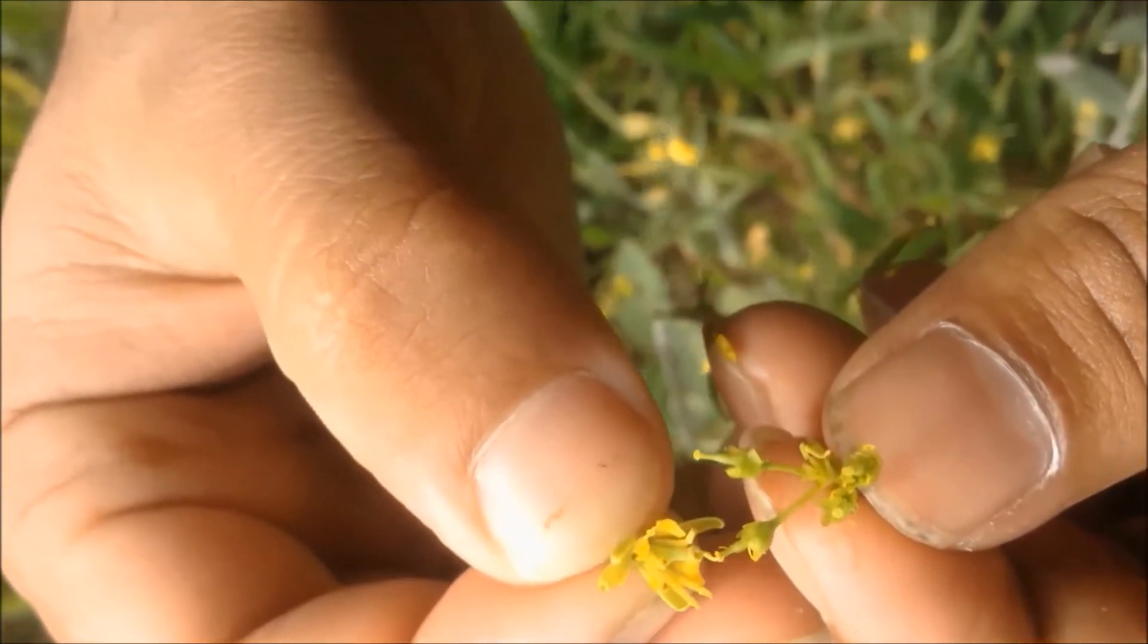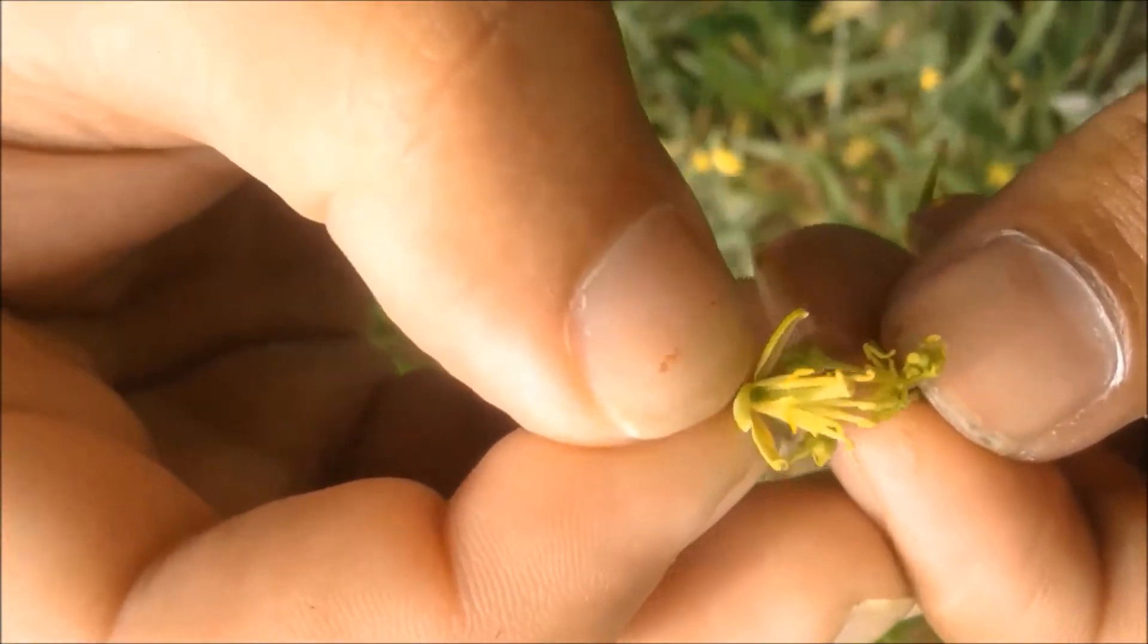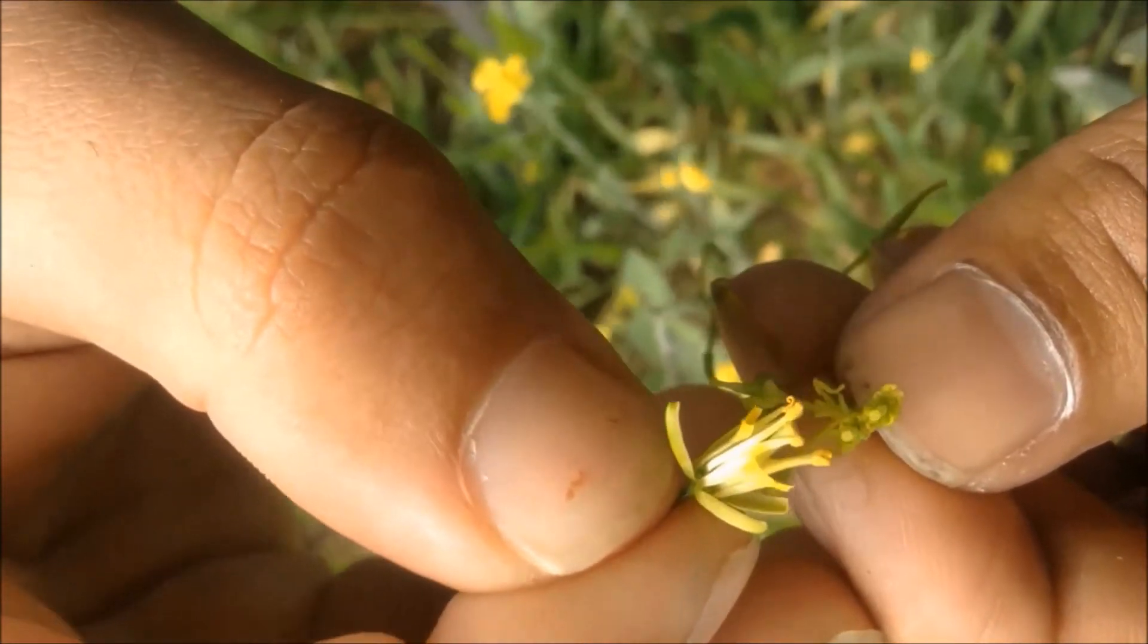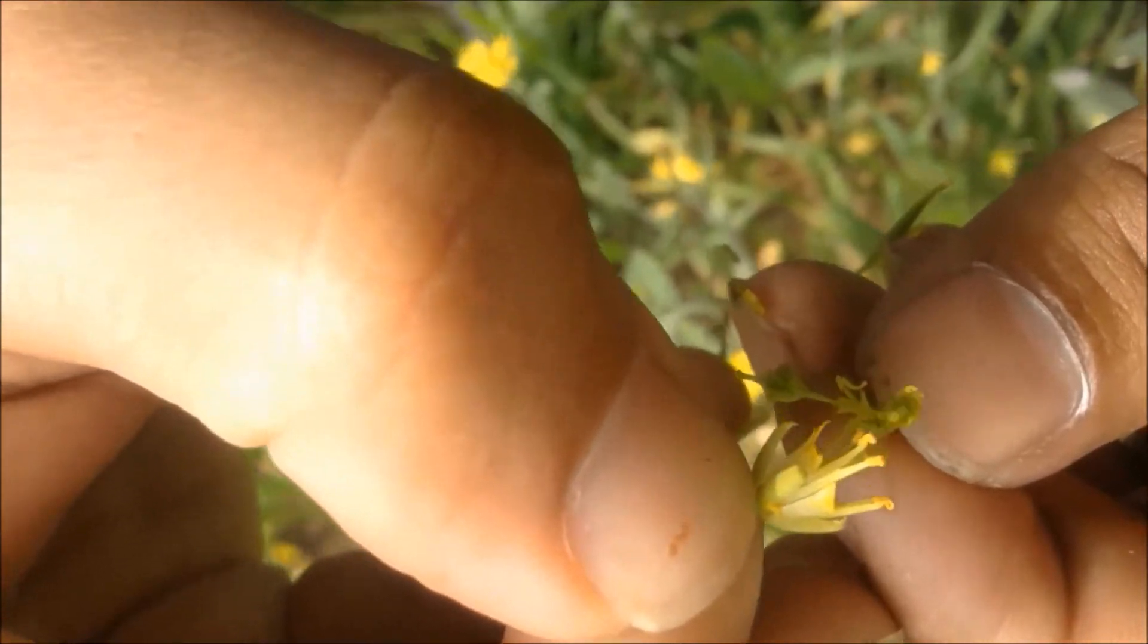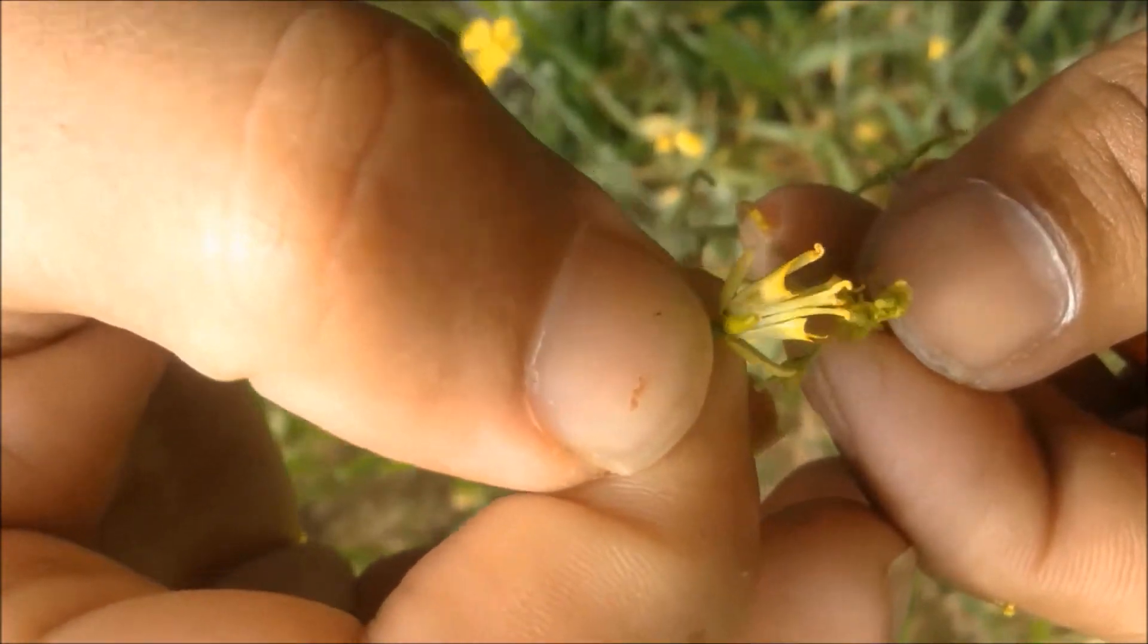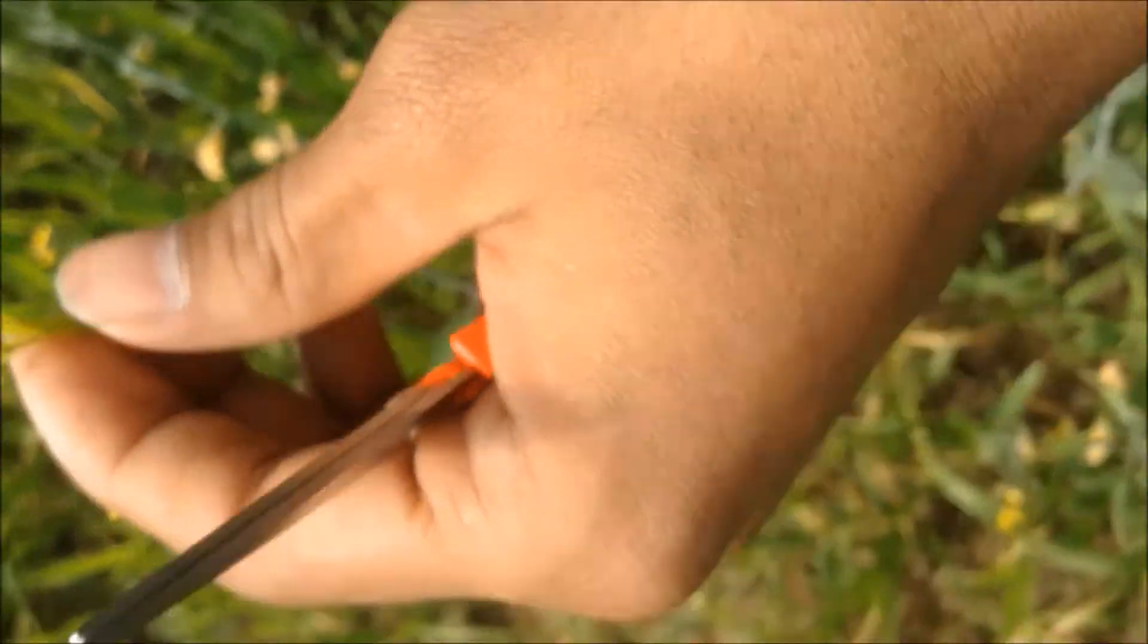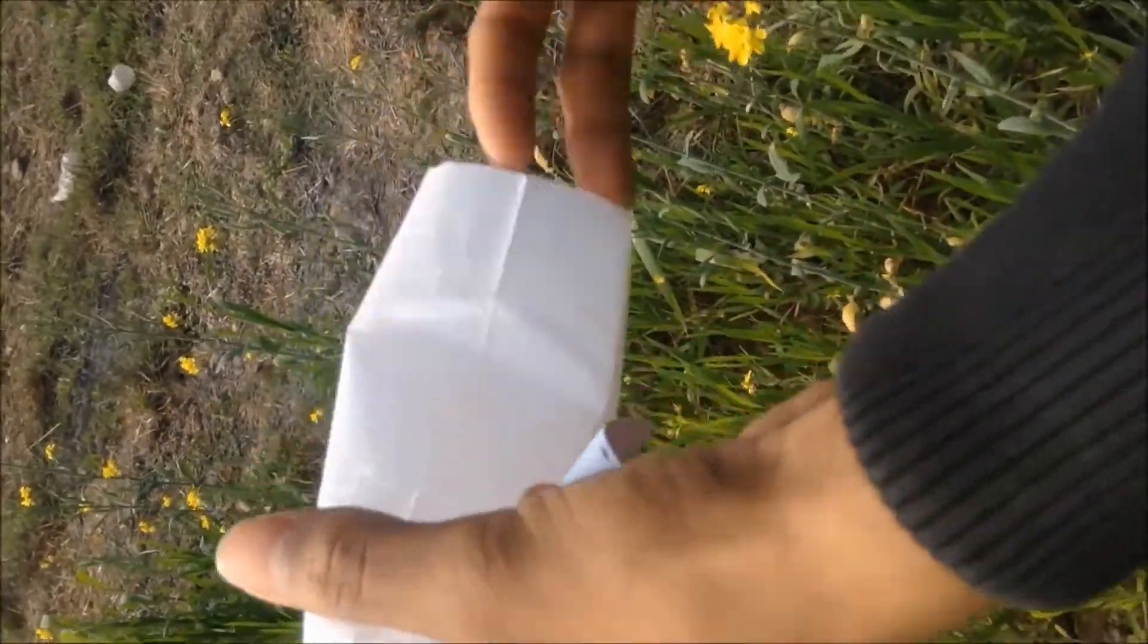Then now I slowly rub the pollen to the tip of each stigma. Now we see the tip of each stigma rough and yellowish than before. This confirms that the pollination has been done in the mustard.